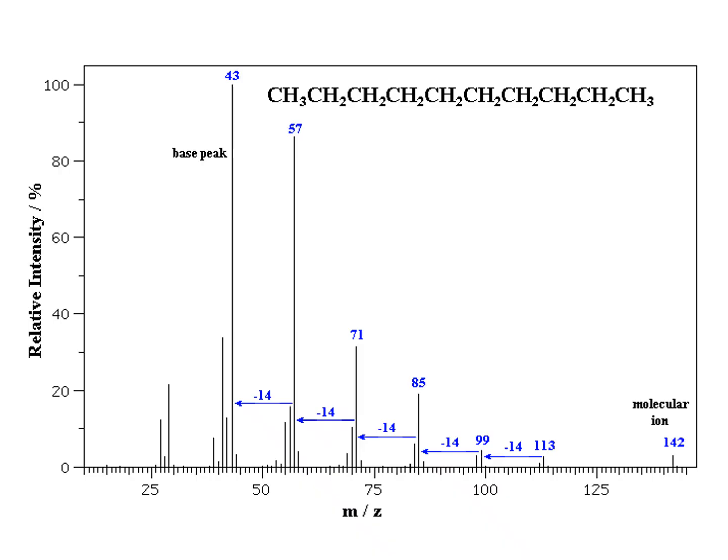we have a molecular ion, 142, which is the mass of decane. If you look very closely, you'll see that it has an M+1 peak, but again, the M+1 is very, very small relative to the base peak, because it is a fairly large base peak at 43. So you can perhaps come up with how many carbons and hydrogens would have had to combine or would be in the fragment that will create a mass of 43.